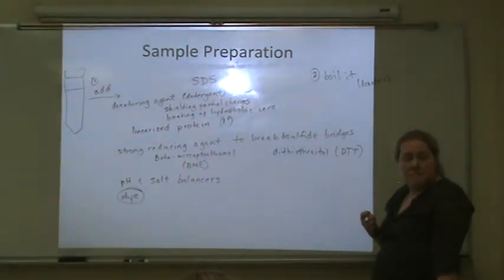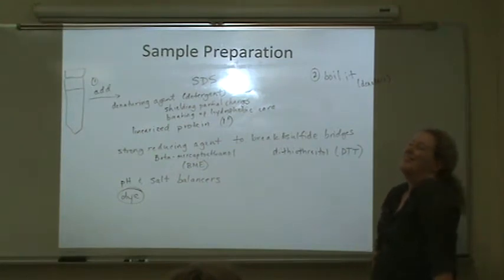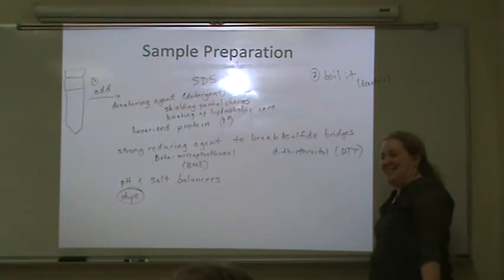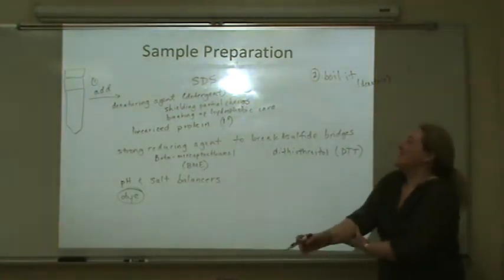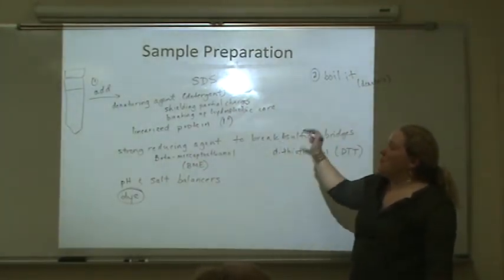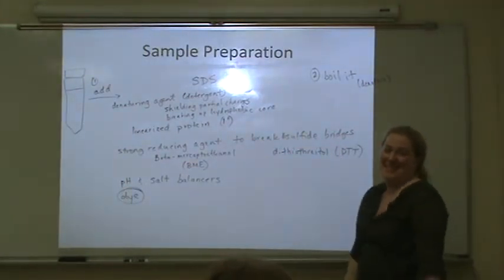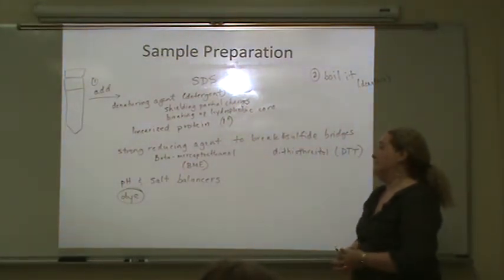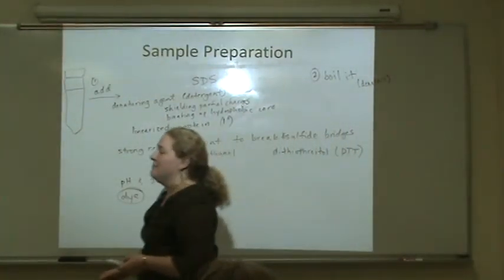So we say a bullet once we get our linearized protein. Say that again. Are we saying bullet after we get it? Boil it. I say it that way too, but I can't understand what you just said. Okay, so bullet step number 2 after we get our primary protein. This is still all considered sample prep, but you would not boil it until you add all that stuff. All right. Say it the same way. That's my worst remaining twangy word.